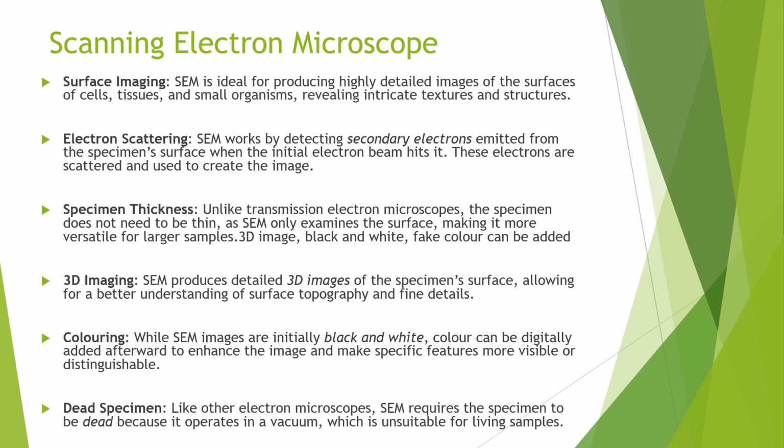However, one important limitation is that SEMs also, same as TEMs, require the specimen to be dead. This is because the microscope operates in a vacuum, which living cells or tissues cannot survive.